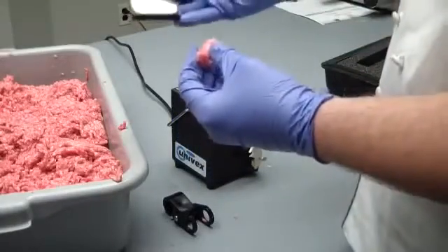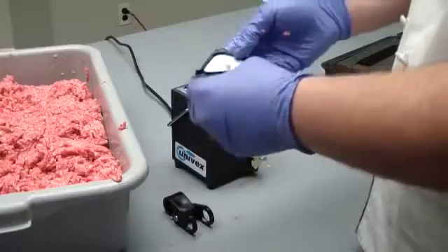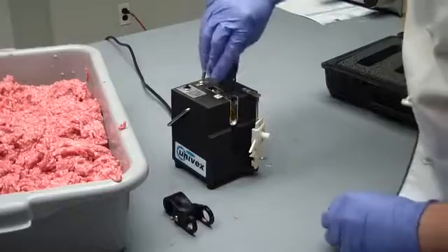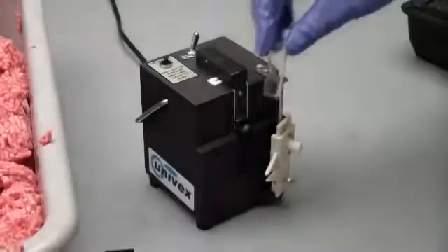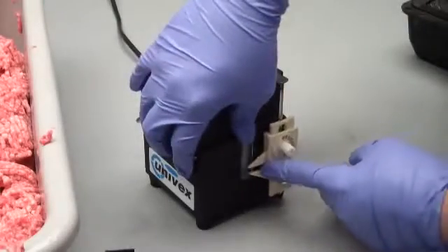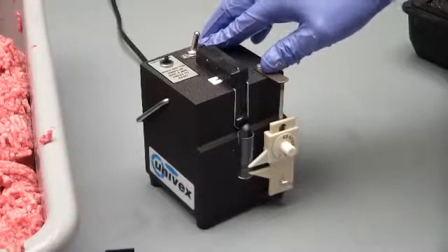You are then going to put the sample inside of the cartridge. When you place the vial in the machine, make sure you use the dial to keep pressure on it. We are now ready to turn the machine on. You are going to let it run until no more liquid comes out of the cartridge.